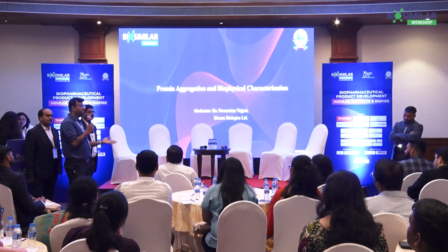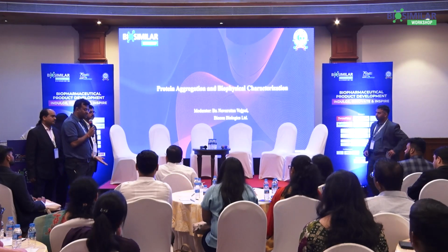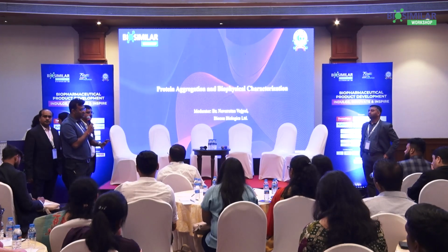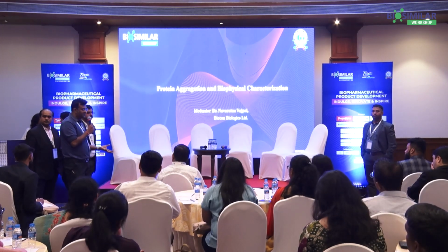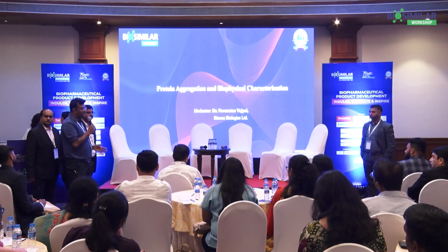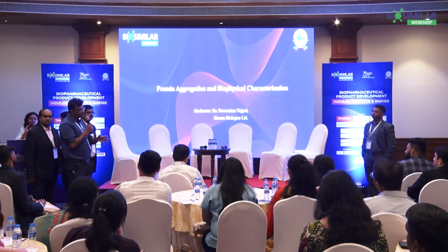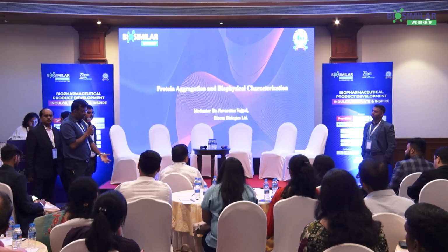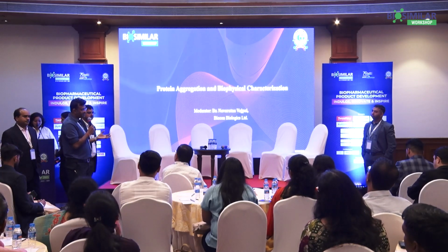You can also do spiking like we do for other physicochemical methodology, where you have a high alpha, high beta, high random coil structure and do a spiking and show at what levels your CD can detect these. But of course, all of this is possible only when, along with the optimization of the methods, we are using these kinds of samples during the development itself.